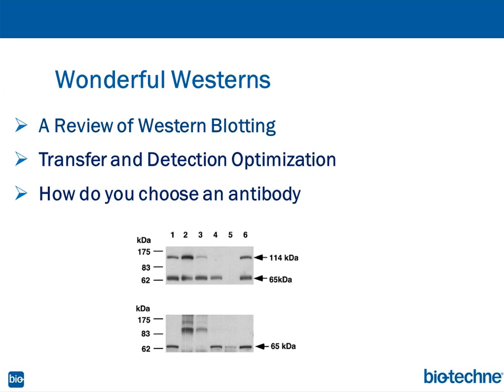I wanted to say a couple things just to start this off. I've seen marketing data that has suggested that when someone purchases an antibody, the Western blot is the most popular application when using an antibody, even to this day. Now, the Western blot was pretty much introduced in the late 70s by a group led by Towbin et al. on the West Coast. I believe it was Stanford University.